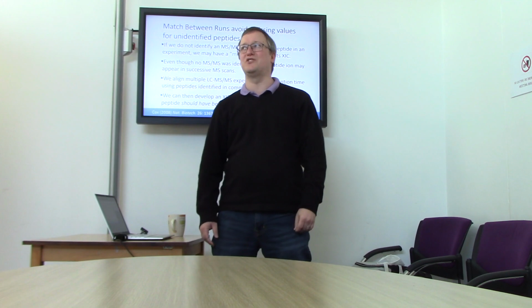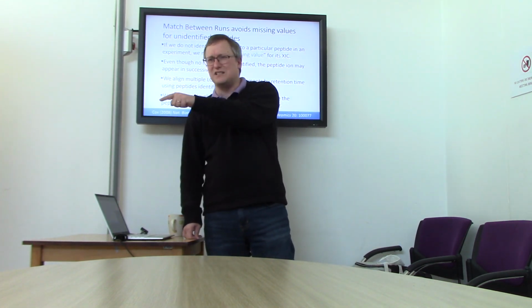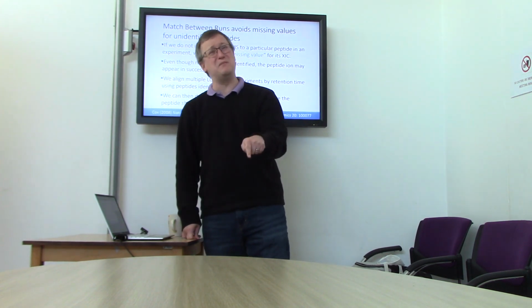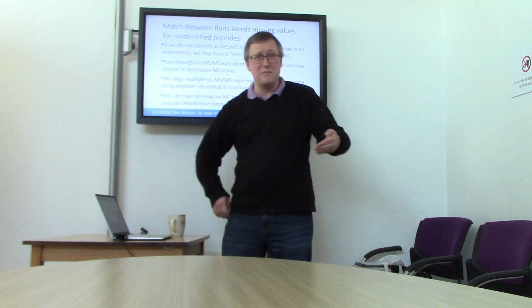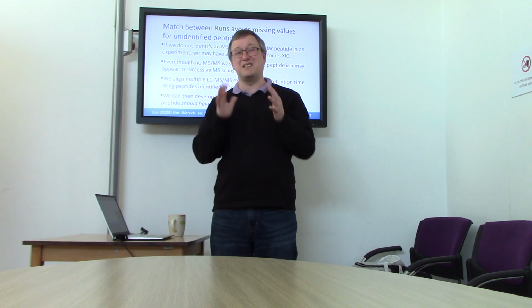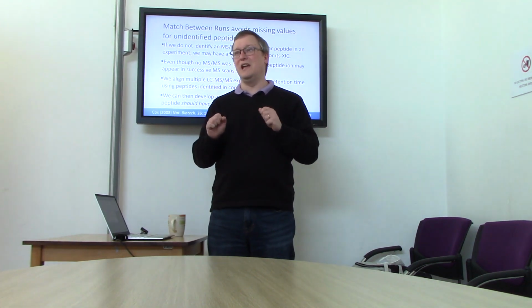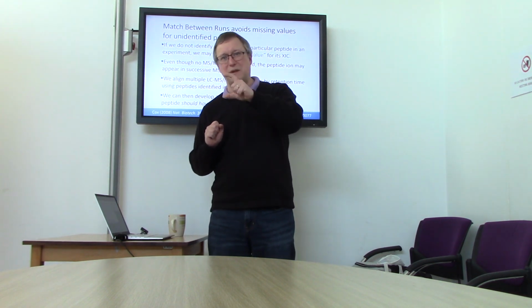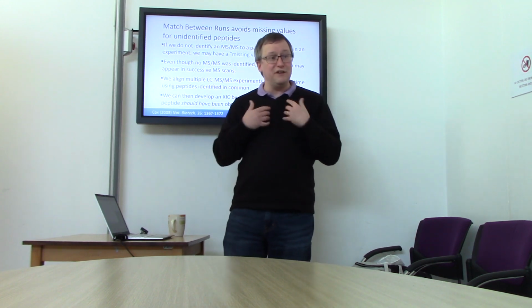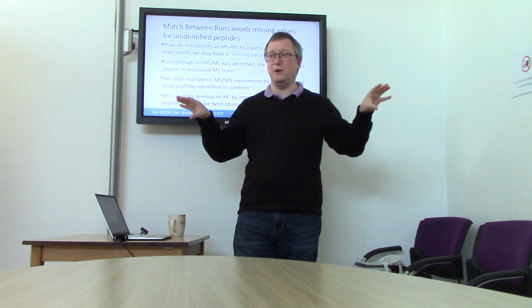Now chromatography is just a little bit slippery. If you see a peptide at 17.8 minutes here, it might be at 17.6 minutes here, or it might be at 18.3 minutes here, or you might have very regular chromatography and everything is golden. But the reality is we expect some amount of slippage back and forth. So we need some way of asking how accurately do we know where this peptide ion should be in retention time in this file.